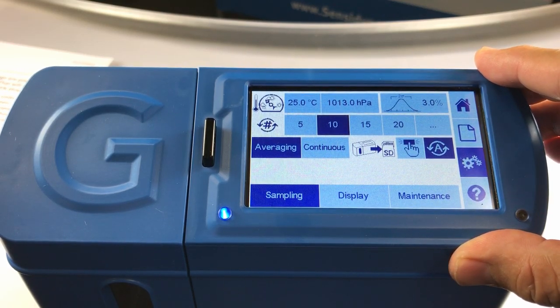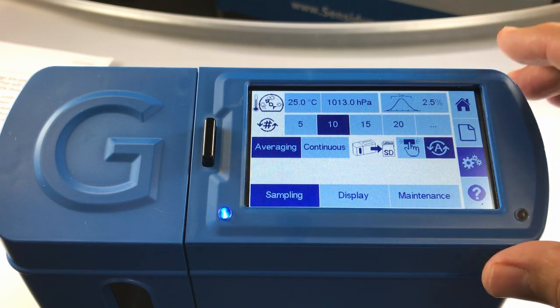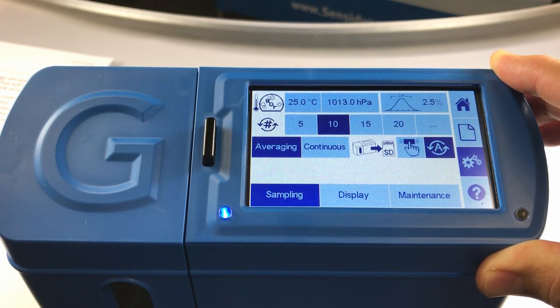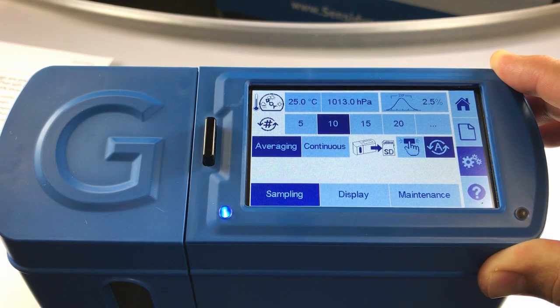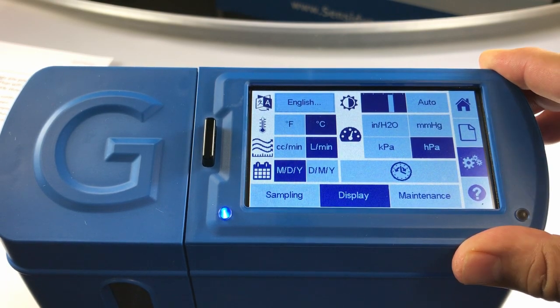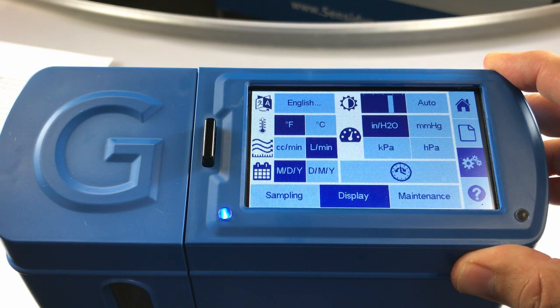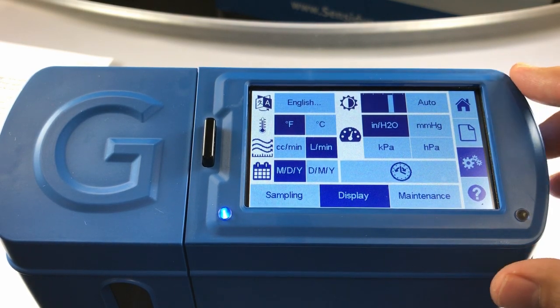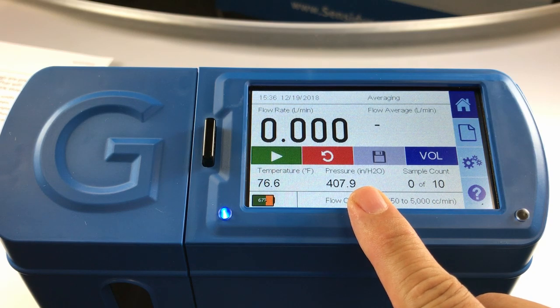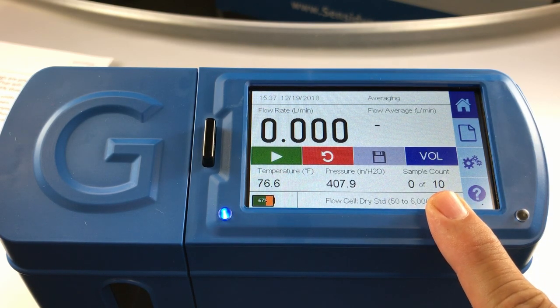I want to make sure that my readings are precise, so I will set my statistical threshold to 2.5%. That will alert me if my percent deviation is outside of my 2.5% threshold. I also want to configure some units of measurement, so I will open the display screen. I'm going to change my degrees Celsius to degrees Fahrenheit, and change my hectopascals to inches of water. I can then touch the home screen button to return to the home screen and verify that my temperature and pressure units have changed, and confirm in the lower right corner that my sample count has been set to 10.